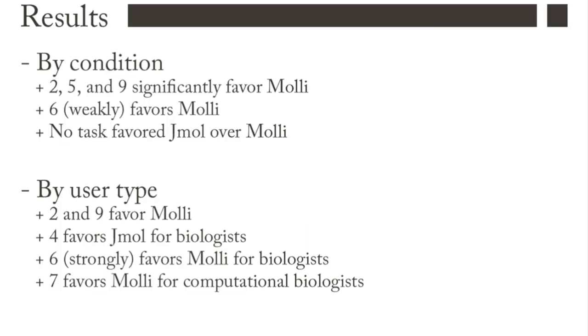A measure of time to completion was recorded and used to compare the conditions. Both aggregate and by-group analyses were performed. Between conditions, aggregate analysis showed tasks 2, 5, and 9 are statistically significantly different in favor of the Molli interface.